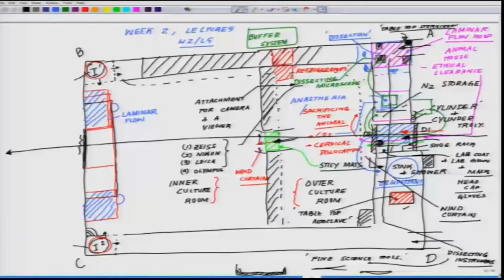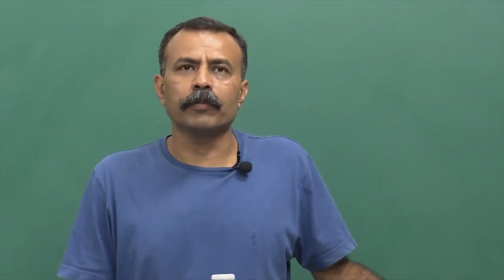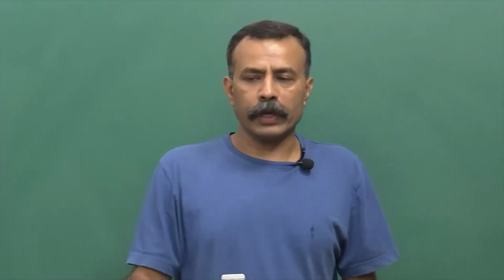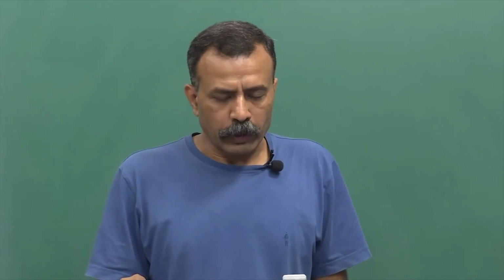So you have these laminar flow hoods here. You have the countertop, of course, which I am shading in black now. You have the countertop for all other works. Whatever purpose you have in the lab, you need to have a decent compound microscope. Now this is something we'll be discussing a little bit more.